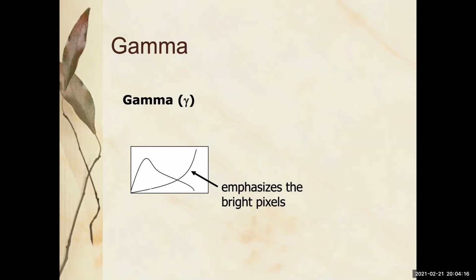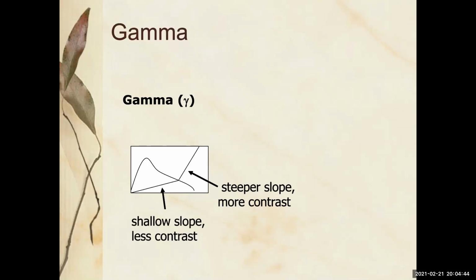It can be amazing. It can be so, so, so useful. What it does is compensate for images where there's extreme bright and extreme darkness, and you can't see the dark without saturating the bright. It depends on your image, but this one, for instance, emphasizes the bright pixels. It will be displayed as a curve, but what you're really doing is two linear slopes.